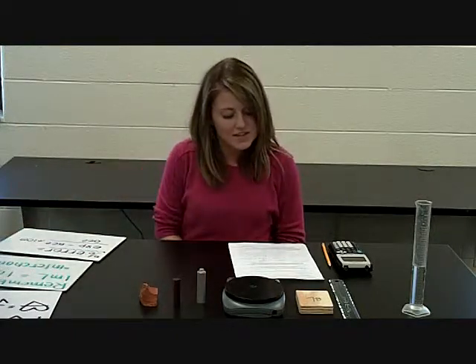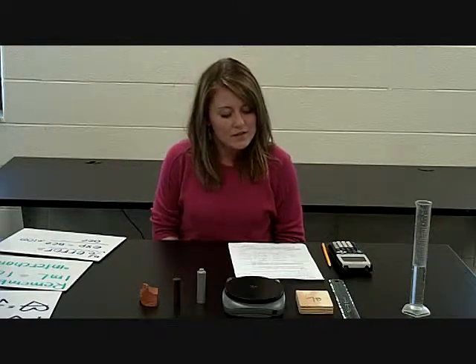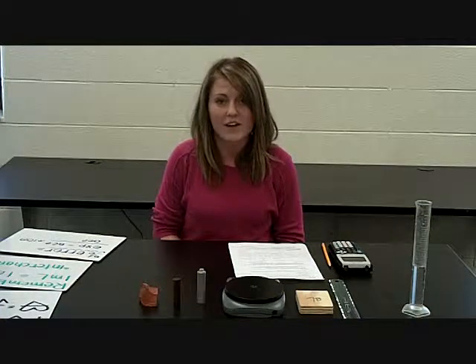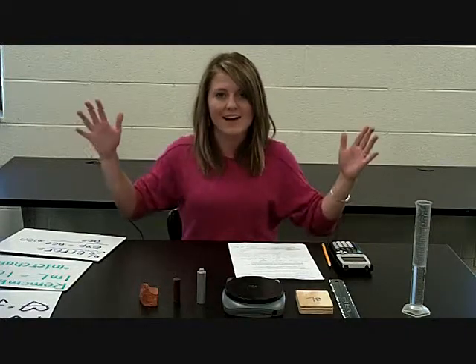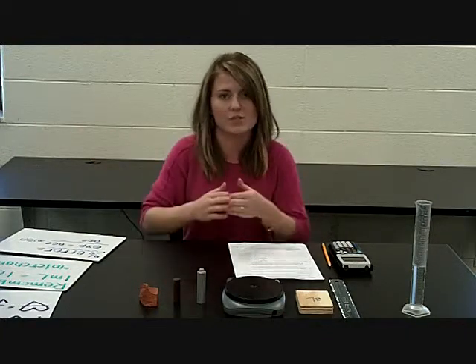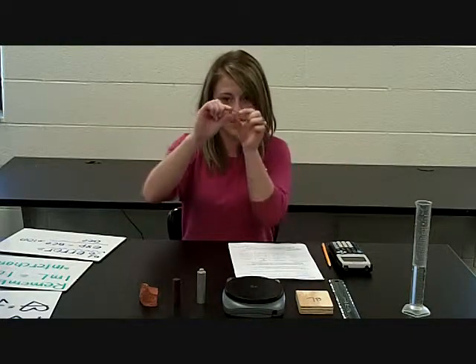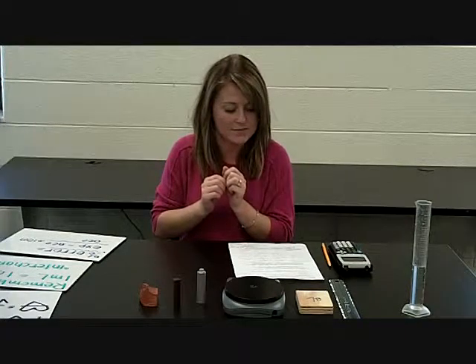For most solids and liquids, density is written in the units of gram per centimeter cubed, grams being your mass and then your centimeter cubed being your volume. For gases, density is sometimes written in units of gram per liter. You might ask why that is, okay? Just remember that gases are extremely light, so you need a lot of gas in order to get a decent measurement of gas. So gases, you're going to need a full liter instead of just a teeny tiny milliliter to get an accurate mass of that gas.